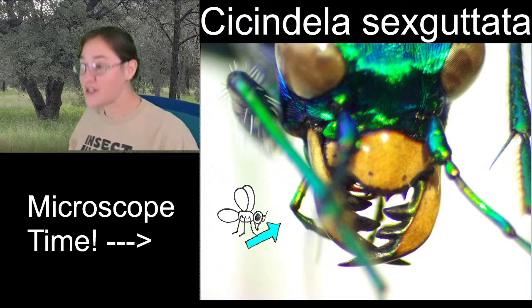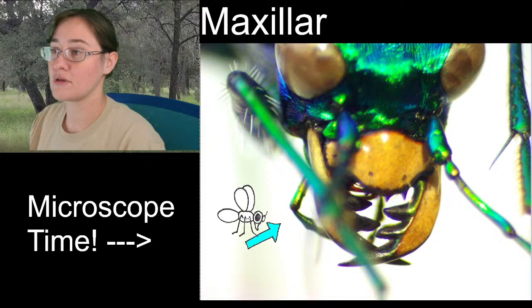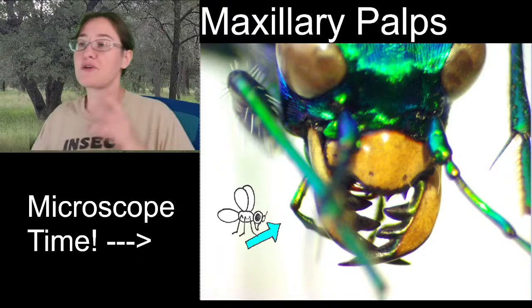So those ones that we're seeing that are really long here coming out from the end, those are actually our maxillary palps. Those are going to be connected to the maxilla and right above the bottom jaw. So that's what those are. And they're used to grab onto to help kind of push the goo and push their food into their mandibles. They're mouth fingers. They help do this.